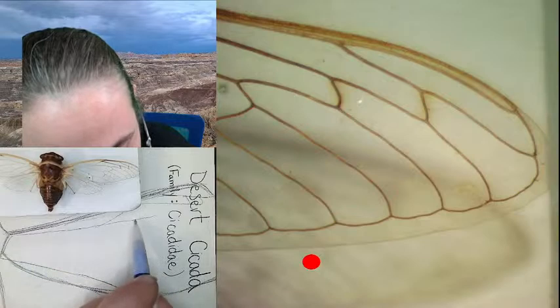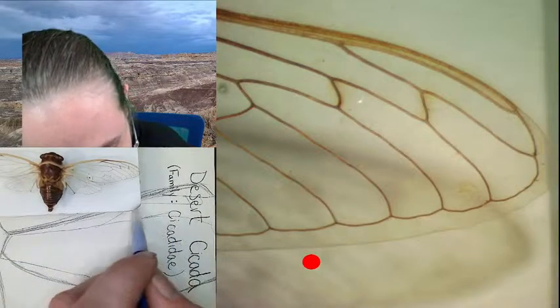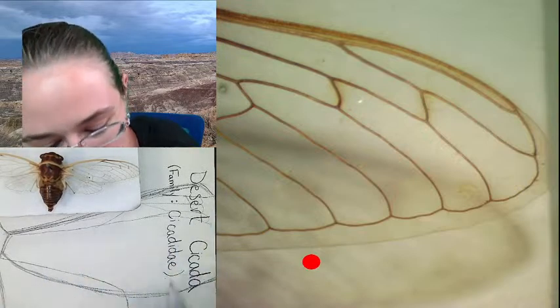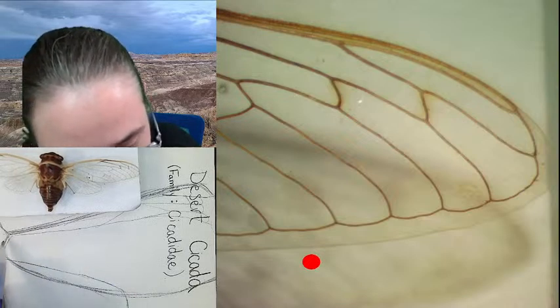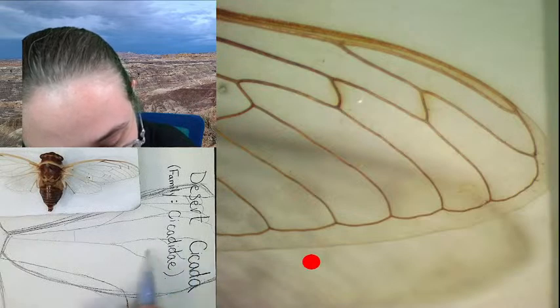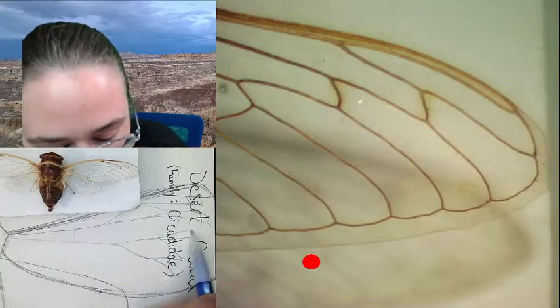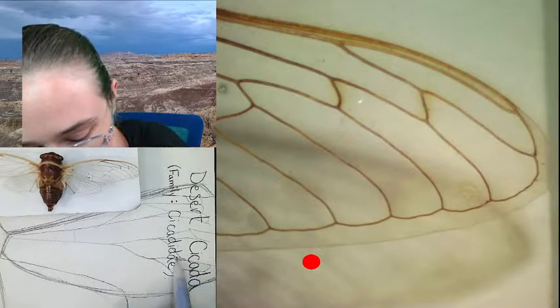So let's see. My cicada's wing is going into the names, but that'll be fine once I get some of this stuff taken care of. So these wing veins, they break off into what looks like they split three times and then come to a scallop.